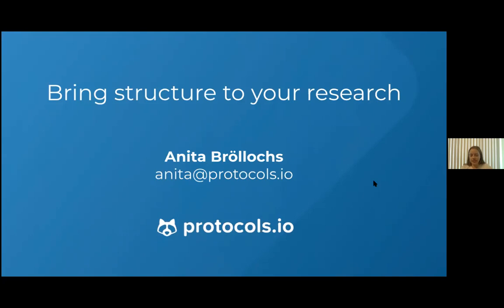So it really depends on what your supervisor, or whoever set up the workspace for you, chose for the settings. But if you're part of an academic research lab, a lot of times the lab might have two workspaces. One is for public sharing and one is for private collaboration. If you're ready to share things publicly, you could put it into the publicly facing workspace. And if it's private, you will keep it in the invisible workspace.